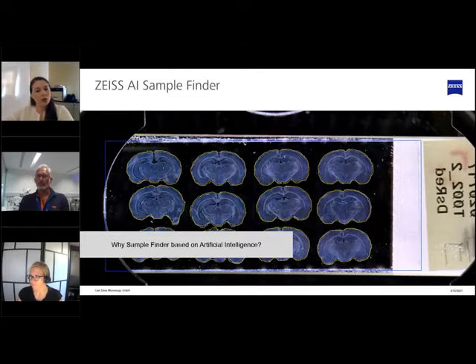I would like to welcome you to today's Zeiss virtual workshop. We will learn how to use artificial intelligence to drive efficiency in your microscopy setup. My name is Colleen Manning, and I am the Product Marketing Manager for Wide Field and Automation. I'm here with Dr. Samantha Four, the Product Marketing Manager for Laser Scanning Microscopy. We will be your hosts today.